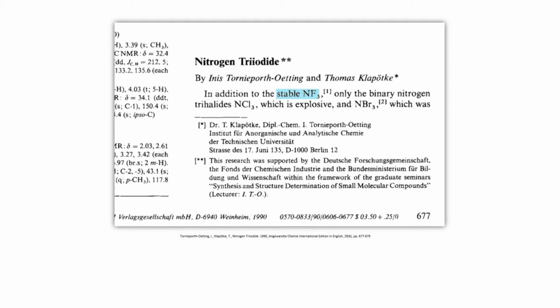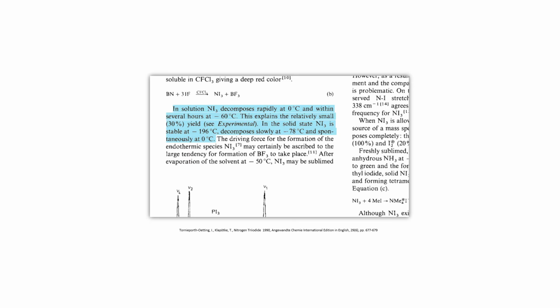Now, let's get into the main subject. What happens if you pour liquid nitrogen onto nitrogen triiodide? I mean, since liquid nitrogen has an extraordinarily low boiling point of minus 196 degrees Celsius, theoretically, you could increase nitrogen triiodide's stability by not providing the activation energy for its explosion.